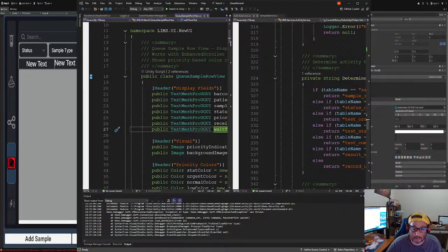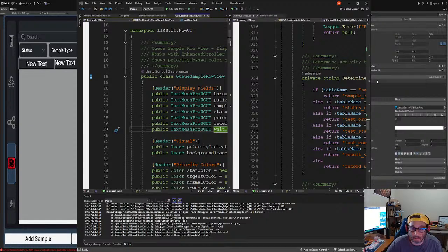Now paste. Okay, so now almost there. All right. So then we. Oh, that looks weird. It looks weird. Did I paste it right? No. There we go.